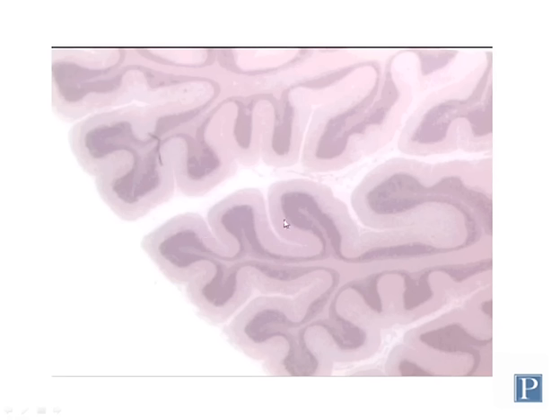You'll notice that in an H&E stain preparation with cerebellum, the gray matter of the cerebellar cortex doesn't look all the same. You have a lighter layer and a darker layer. There's actually a small layer in between that you really need to look at a higher magnification view to see. So the reason for that is there are three histologically distinct layers in the cerebellar cortex that you need to know.